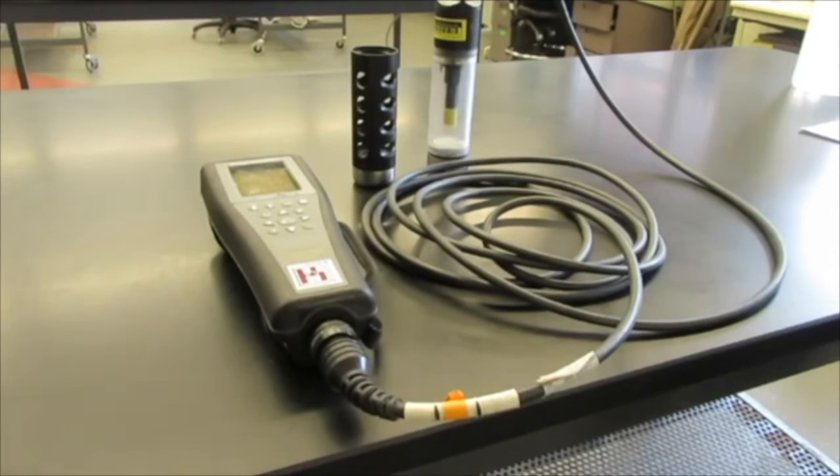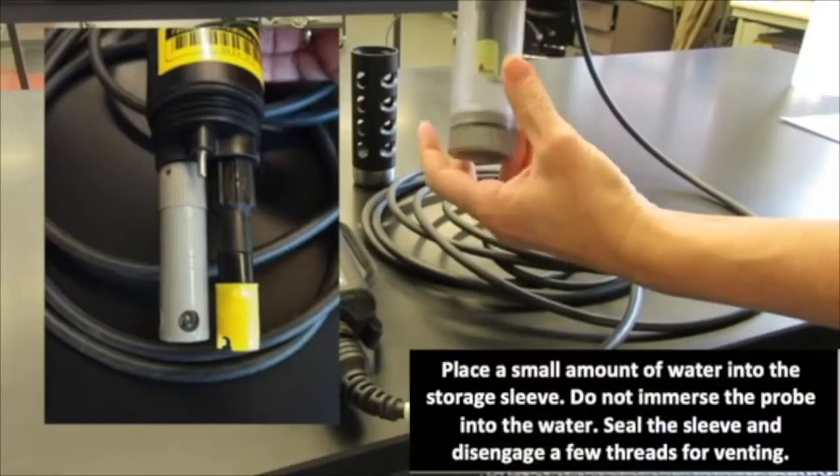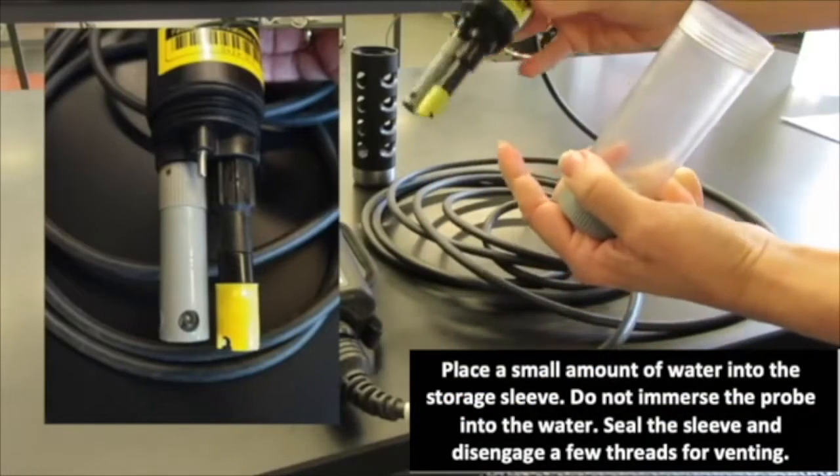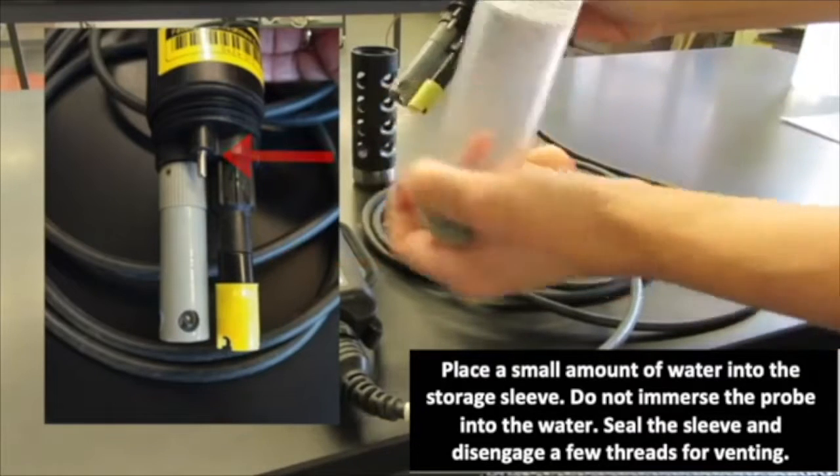Before using the YSI ProPlus multimeter, we need to calibrate dissolved oxygen before every usage, before going out into the field. What we have here is a plastic storage sleeve with the probes. This is our dissolved oxygen probe, and we have temperature and pH.